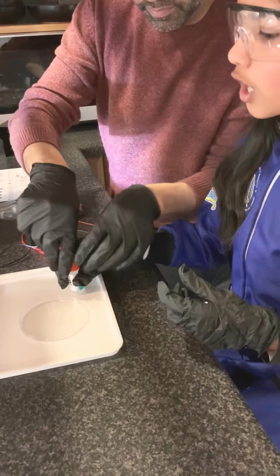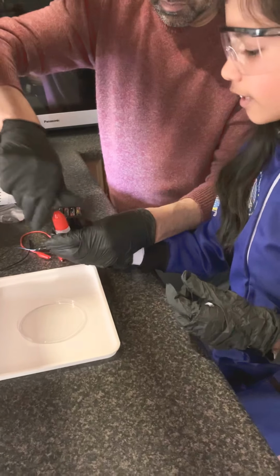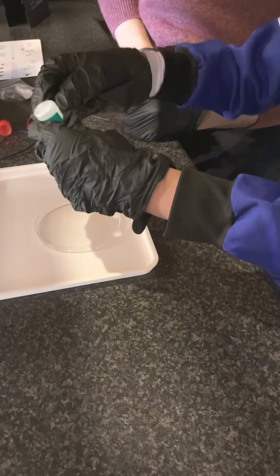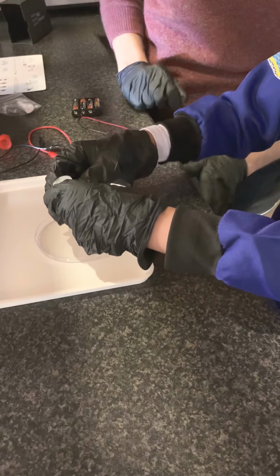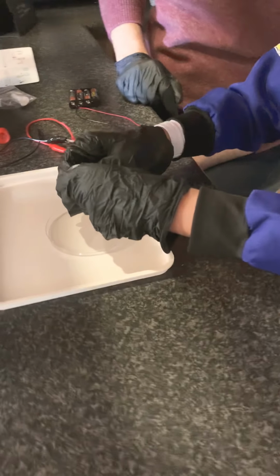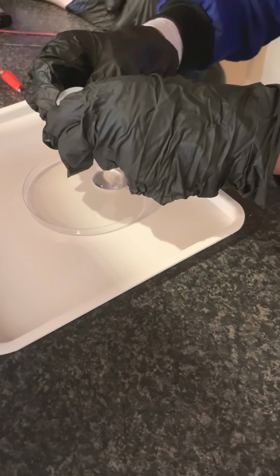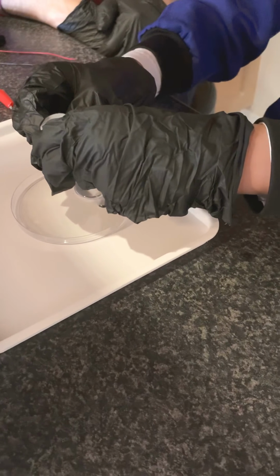Now you need to pour all of this solution inside here into this petri dish. Okay, very good. Now don't squeeze it too hard. Don't leave it at the bottom. Yeah, excellent. Let it come out slowly, all of it, into the petri dish.